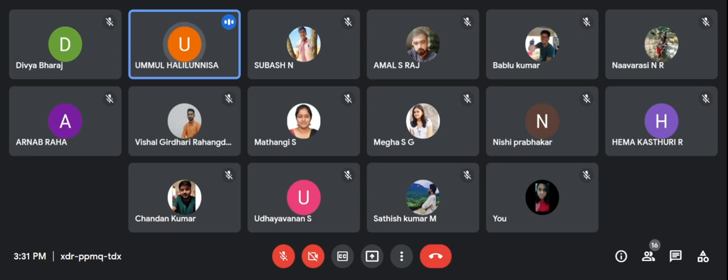Okay, we'll perform both, PRATT as well as ScanProsite. We'll check ScanProsite.